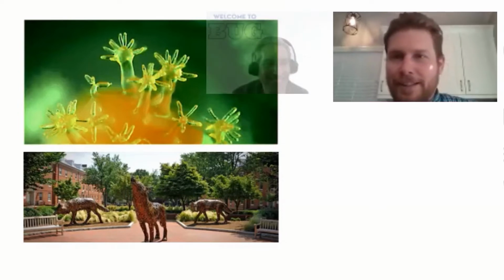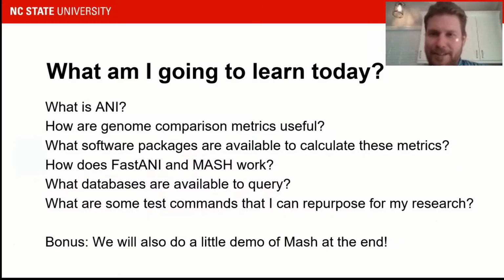So what am I going to learn today? Throughout the seminar, I will ask questions from your perspective. We're going to answer this question by asking and answering these other questions. What is ANI? How are genome comparison metrics useful? What software packages are available to calculate these metrics? How does FastANI and Mash work? What databases are available to query? And what are some test commands that I can repurpose for my research?